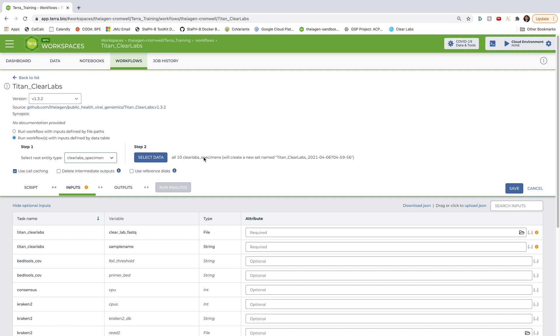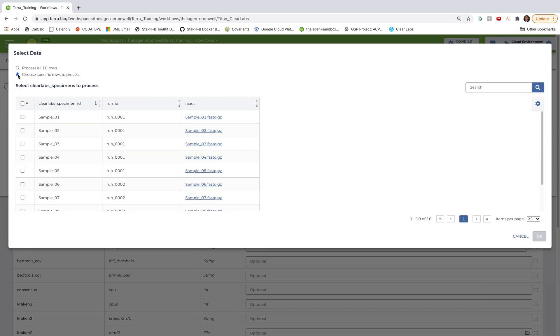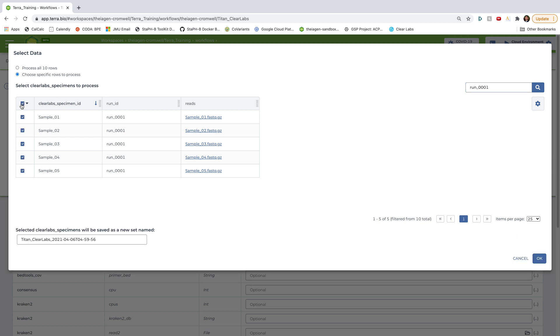So to get those samples specifically, we'll go ahead and select data. And then click choose specific rows to process. From here, I can use this search bar to look for samples that are associated with run underscore zero zero zero one, and hit enter. And boom, here are my five samples. So then I'll go ahead and click this top left check mark here to ensure that I select every sample that is viewable on this table. And then I'll hit OK.